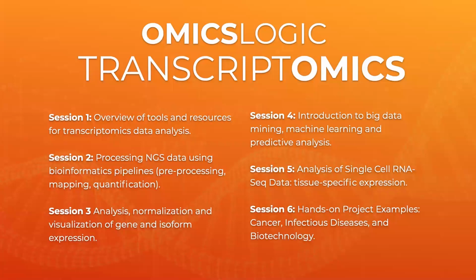So in fact, how we can take markers from different tissues discovered through single-cell RNA-seq and apply decomposition of bulk RNA-seq data. In session 6, we'll take a look at a few hands-on project examples, and these will be from the domain of cancer biology, infectious diseases, and biotechnology.